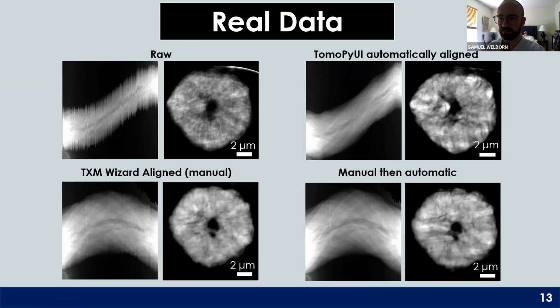Ideally, you do have some kind of ground truth that you can say, hey, this is actually better and more true than what the manual alignment does. Do you see, I guess? So here in the alignment, do you only apply translation alignment and no other, for example, affine transformation? Because if we look at the sinogram on the top and the bottom, it seems the sinogram's signal width is different. Yeah, this is a scale bar issue for this particular data set.